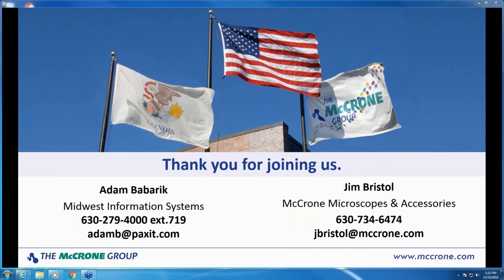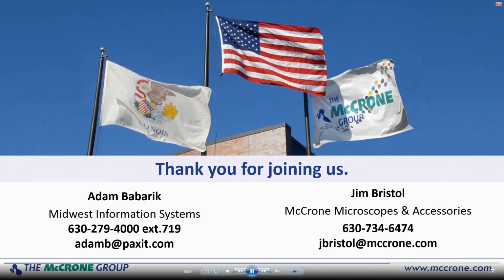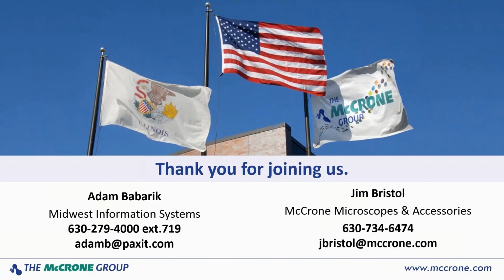However, when you're considering something like a Twain camera, it's not so much PAXit as much as it is certain considerations that if it is a third-party camera, you as the user are responsible for making sure that the only application you can access it in is PAXit. If you have another application on that system that can open that camera, it means you can potentially capture it to other areas and doctor the image before insertion into PAXit.